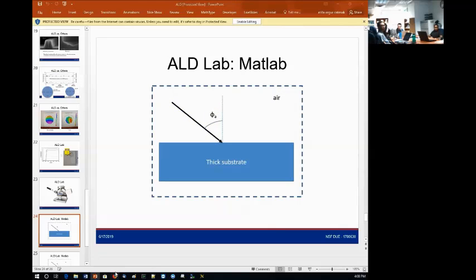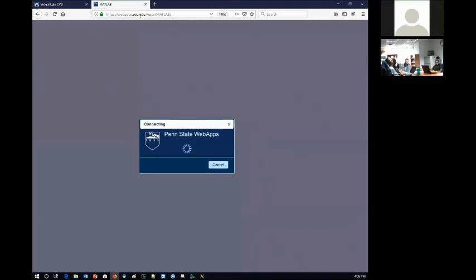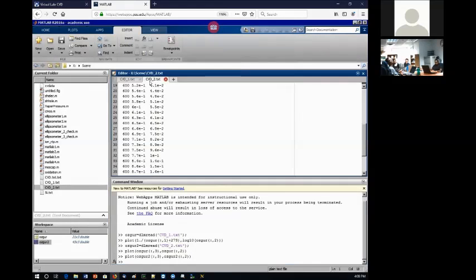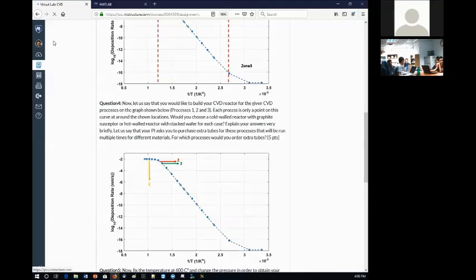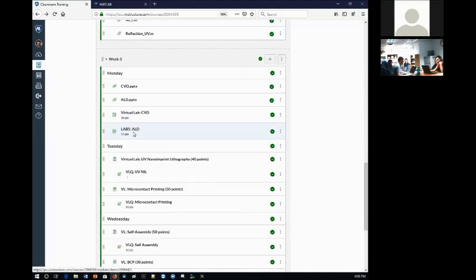So going back to MATLAB. Let's close these guys, and you can close all that, CVD1, CVD2. Make sure that you have silicon.txt under the same folder with ellipsometer 1, 2, and 3. Okay, those are the things that we will use. All right, so this is the first thing we're trying to achieve. I will show you illustratively ALD.